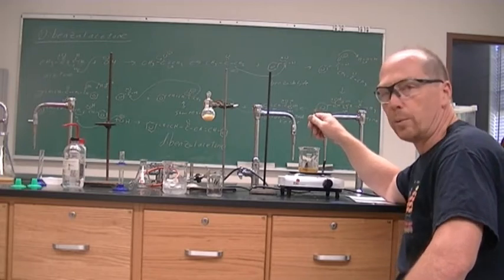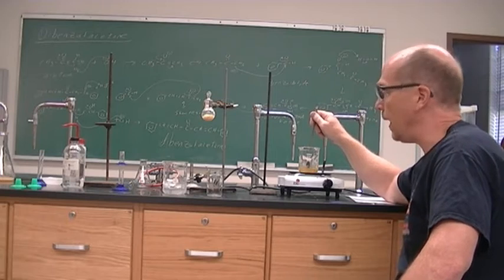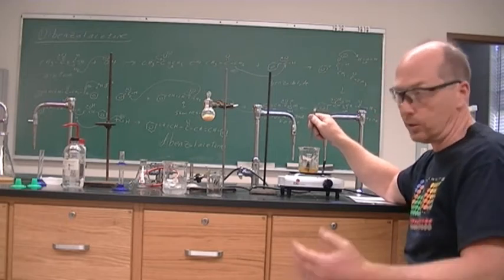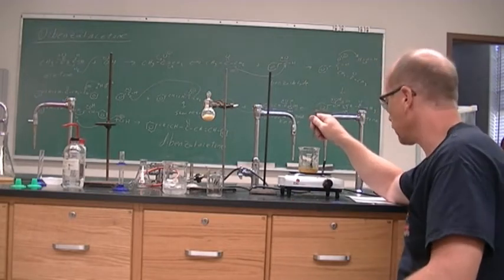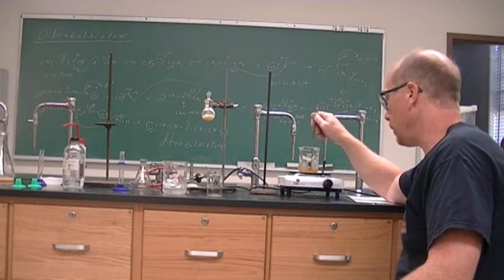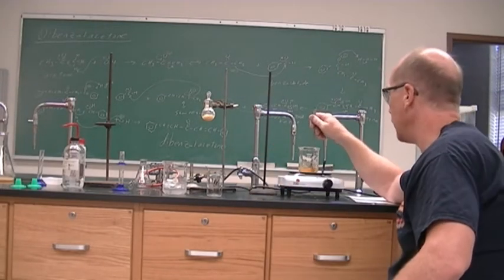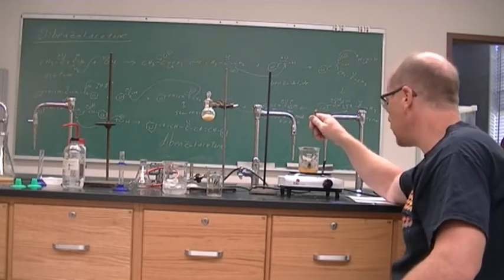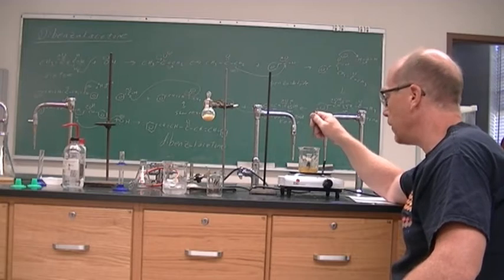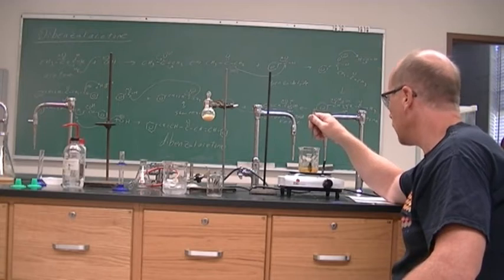Now we have two double bonds that are being formed. And so they can be formed as both of them trans, which is the usual, but you can also get a cis-trans. And if you end up with a cis-cis, that ends up to be a liquid, and that would be filtered out. But our trans and our cis-trans product are in here. Now the orange product is the trans product. It is the major product of this reaction.